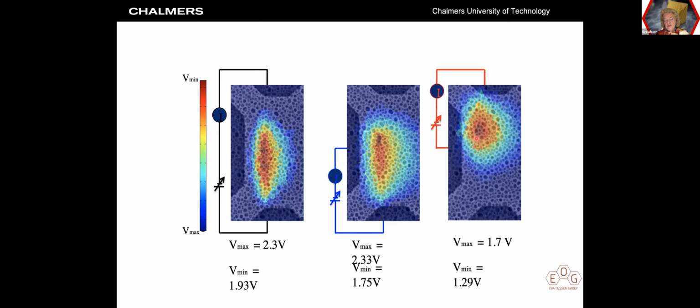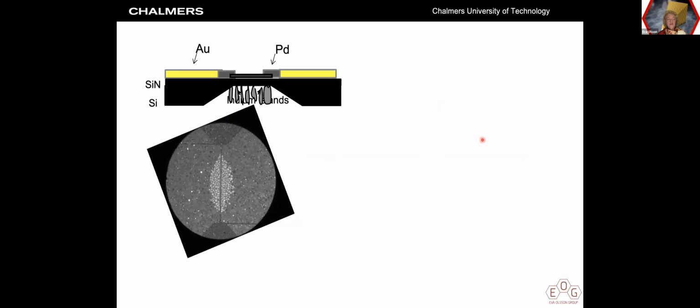The heat conduction through carbon nanotubes is very high. That means that if we had the heating of the carbon nanotube here, we would have seen not only this portion getting to higher temperature, but also this portion because of the thermal conductivity. So we are actually observing a heating of the substrate, not of the carbon. We're getting the phonons excited in the substrate and not in the carbon nanotube in these cases. That happens up to a certain critical applied voltage and current drawn through the structure. So this was a case when we had the carbon nanotube on a silicon nitride substrate.